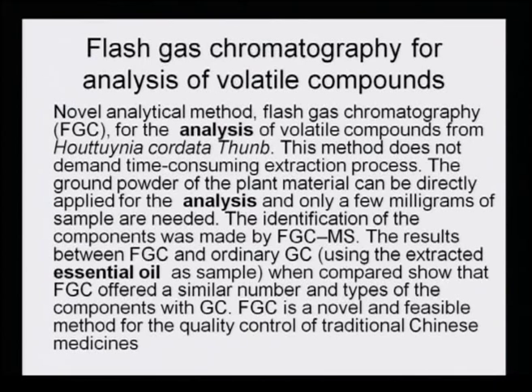The results between the FGC and the ordinary GC, using the extracted essential oil as sample, when compared show that FGC offered a similar number and types of components as what the GC showed. However, FGC is a novel and feasible method for the quality control of traditional Chinese medicine.